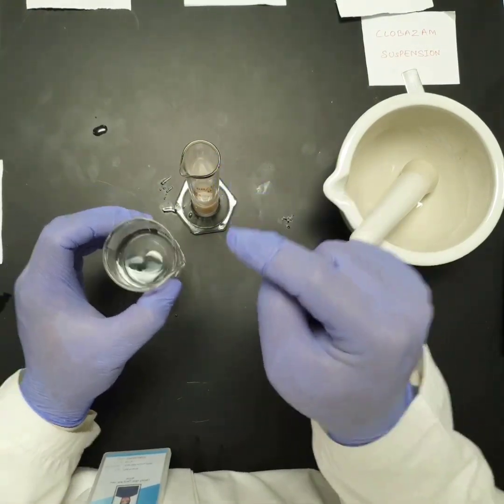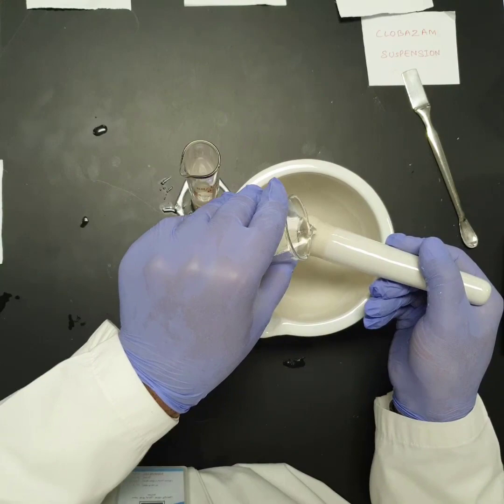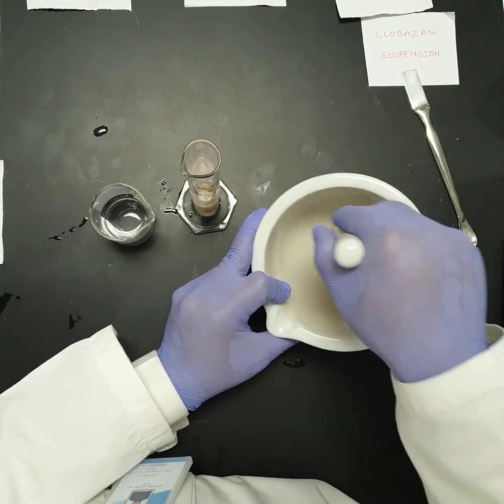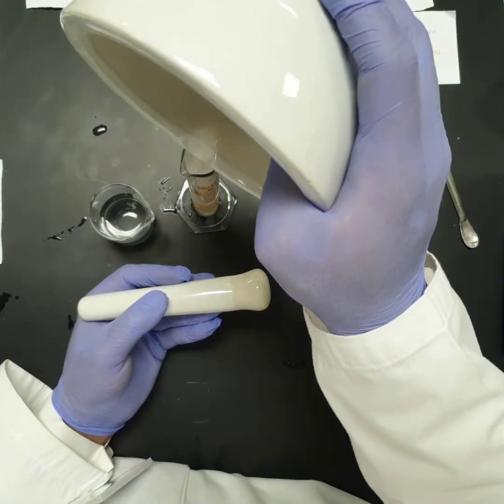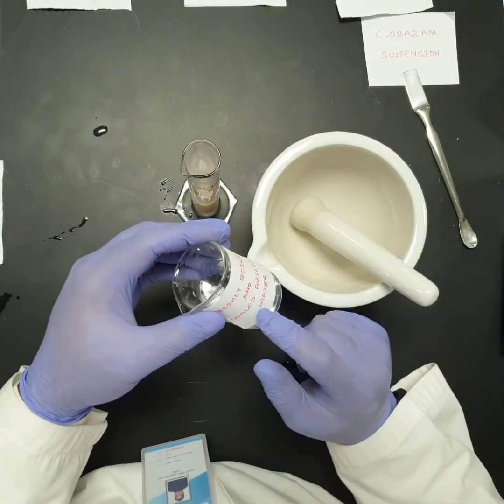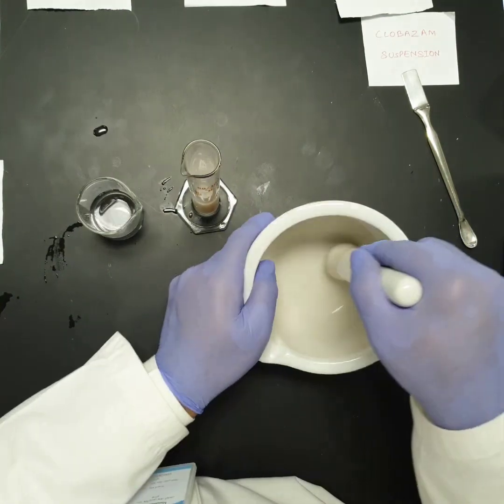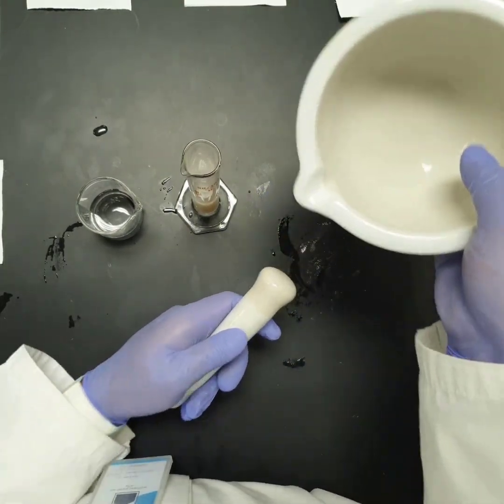So instead of adding it in the graduated cylinder, I am adding this freshly boiled and cooled purified water in the porcelain mortar so that I can wash the mortar more. If there is anything left on the walls of the mortar, by this washing it will come out and I can add the rinsing back to the graduated cylinder. So basically I am adjusting the final volume with freshly boiled and cooled purified water, but instead of adding it in the graduated cylinder, I am adding it here so that this porcelain mortar will be washed thoroughly. Now as you can see, this mortar is washed completely. There is nothing left here.